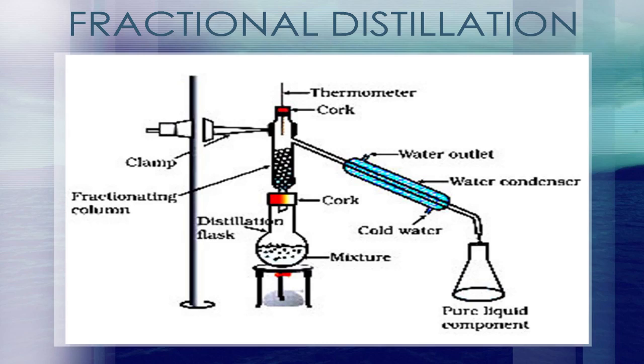As it rises, it cools, condensing on the condenser wall and the surface of the packing material. Here, the condensate continues to be heated by the rising hot vapors. It vaporizes once more. However, the composition of the fresh vapor is determined once again by Raoult's law.